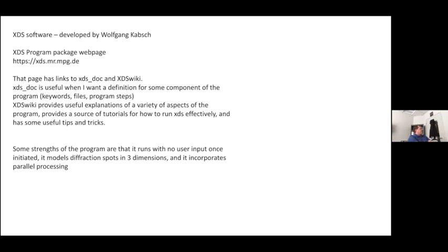And so we're going to focus on XDS because that's the main software that we use here at AMX for our automated pipeline that you know as RAPD. And you saw that work when we did the data collection. And so it's good to understand what's going on with the automated data processing.